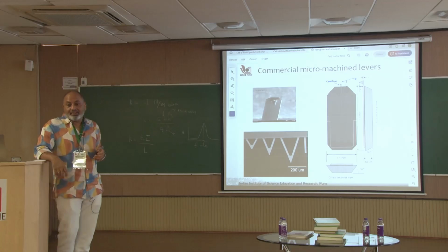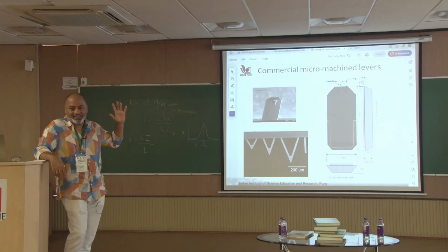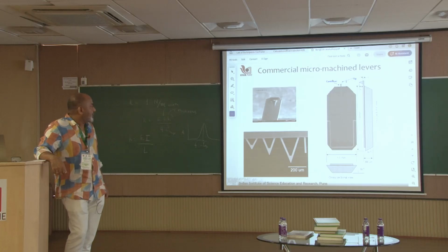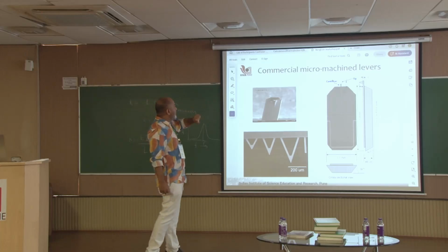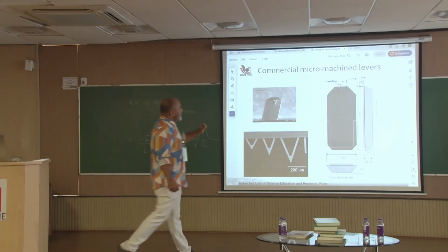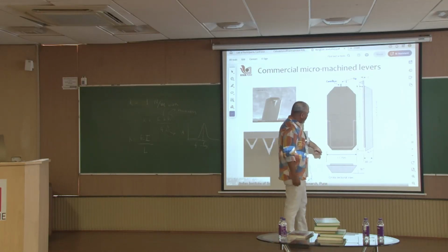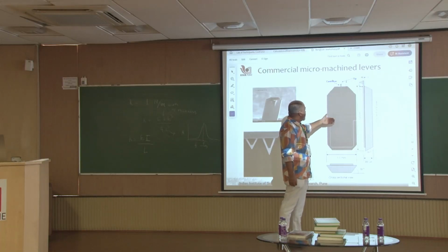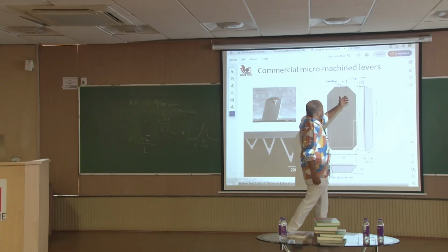That's another technological marvel that we already have in place for something else, and it can be easily used for AFM cantilevers. Okay, so this is the cantilever now, and if you think about a length of 100 microns, this whole chip will look something like 3.4 millimeters with a width of 1.6 millimeters, and that's not important, because this chip is basically clamped with a spring and held together, and that end is free for the sample to approach.